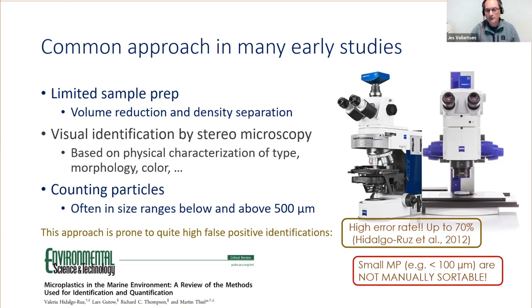If I take some of you who have never done this and let them look at different small particles, you would probably pick out the shiny particles. And these will tend to be, for example, quartz particles, inorganic particles. I tried that once with some students and that was pretty much fun. They picked out all the wrong particles.